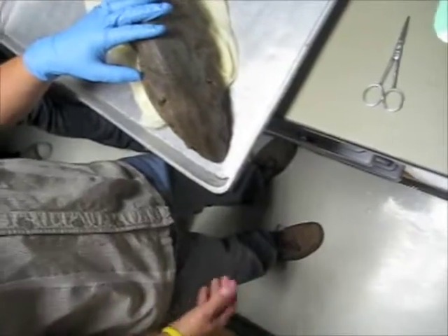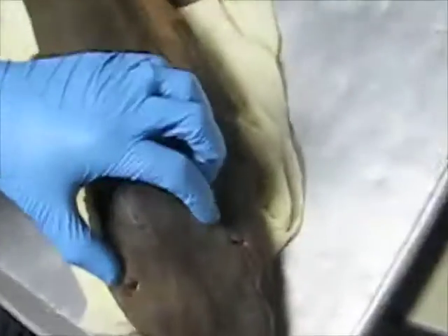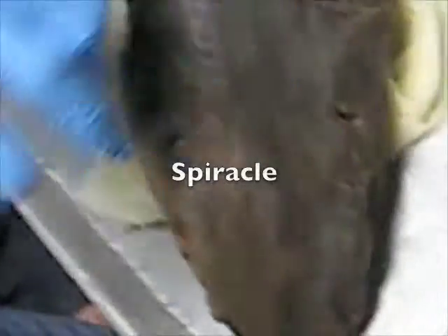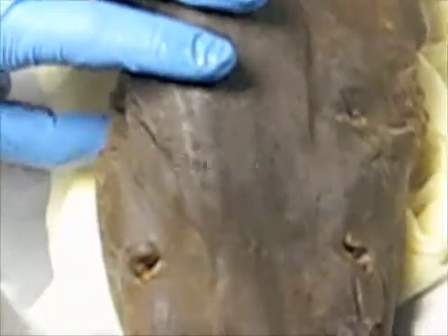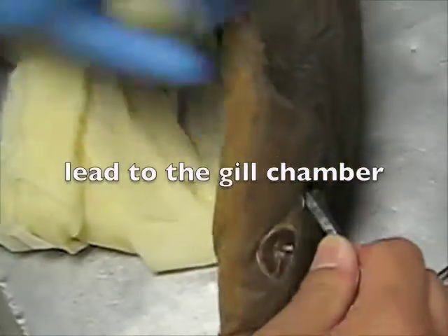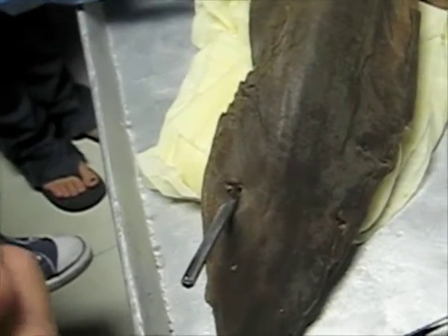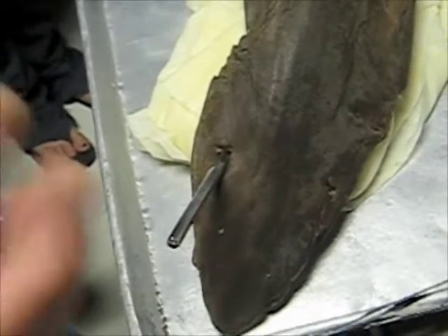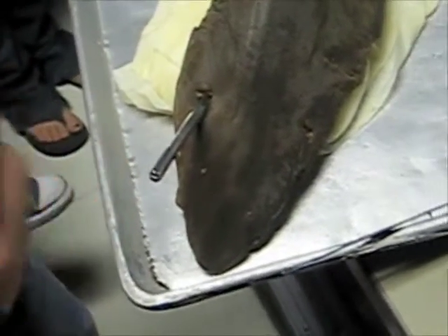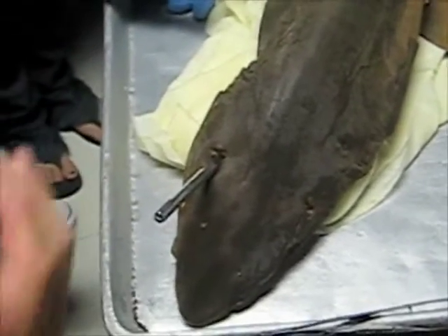A lot of the sharks and a lot of the cartilaginous fish use these openings right here called spiracles. Right. They use that. This will lead down into the gill chamber. Now I'm right here in the gill chamber, so it's actually coming in right here, and there are little muscles there that they can actually contract. When we actually do muscles, you guys will learn that muscle is called the spiracularis, right? And they use that to contract and get water up over their gills.